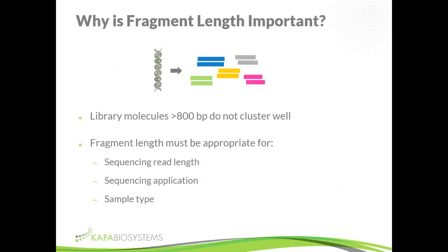In some cases, it's very important to have a very uniform fragment length in your library. So, for instance, for de novo sequencing, where there's no reference genome to align your sequence to, if you have to build that genome from scratch, then the whole bioinformatic process is a lot easier if the fragment lengths are more consistent in size, it's easier to then do an assembly from that.